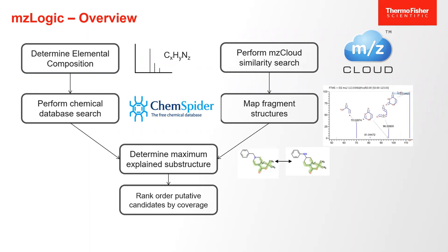Okay, I want this very clear. What is the number one instrument when you want to say what is the structure of a chemical? If I give you an unknown that's pure and clean, what instrument are you going to run to? NMR. You want to know structure? You go to the NMR. The NMR builds structure, right? It's a structure builder. The NMR is not as sensitive, it's not as fast, but it builds true structure.